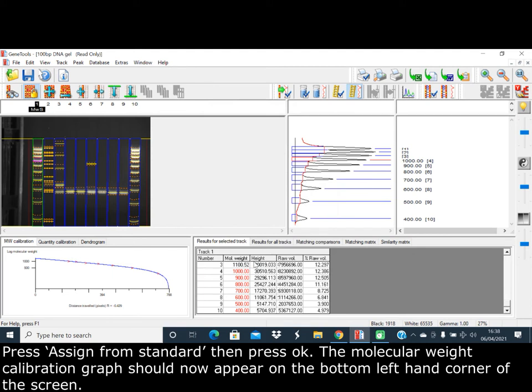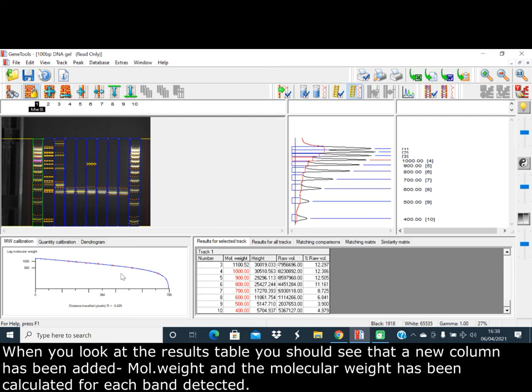The molecular weight calibration curve should now appear on the bottom left-hand corner of the screen. When you look at the results table, you should see that a new column has been added for molecular weight, and the molecular weight has been calculated for each band detected.